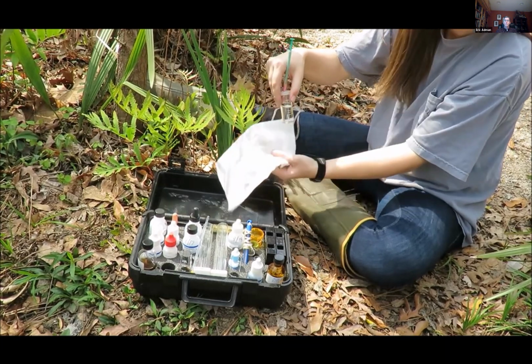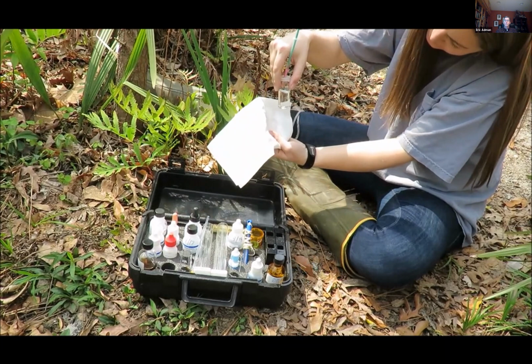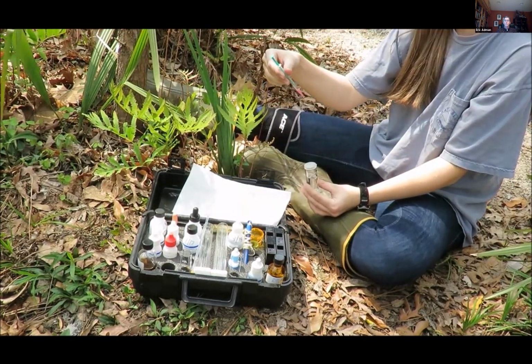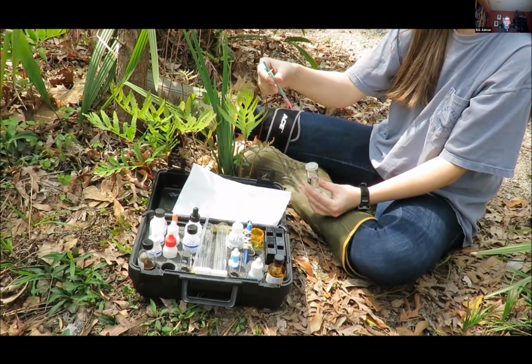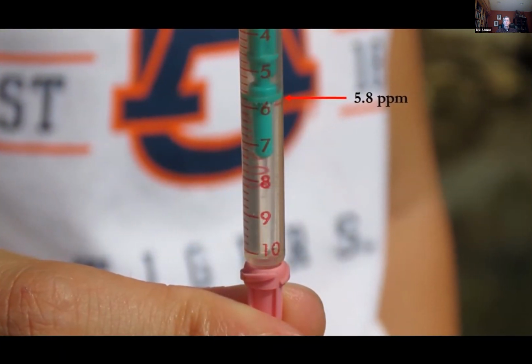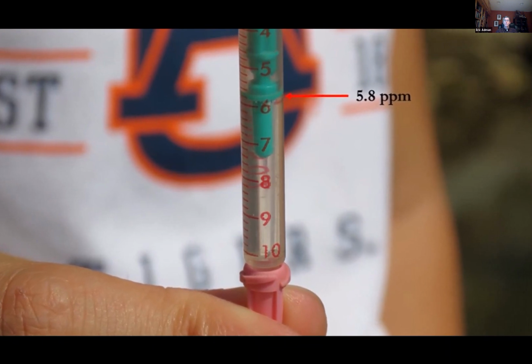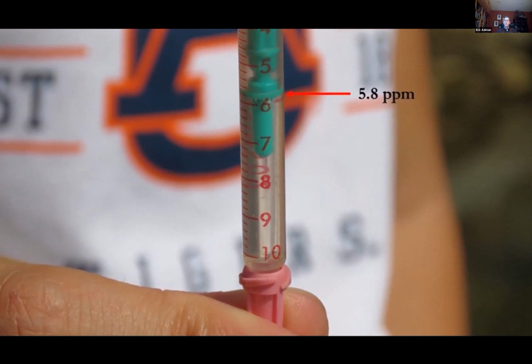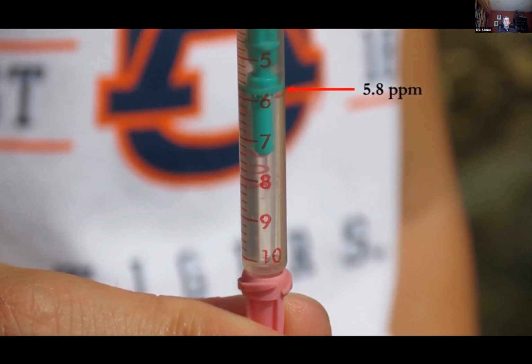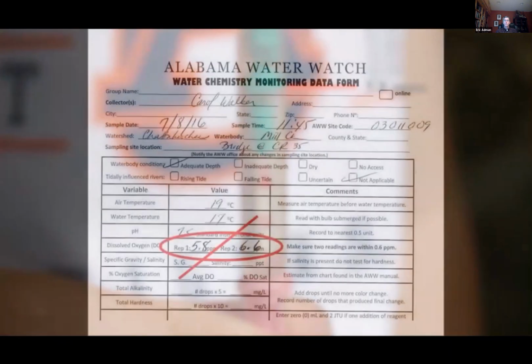Hold the tube against a white background to be sure that the solution is clear and not faint blue. Read the number on the titrator where the widest part of the plunger meets the line on the scale. Each minor division on the titrator scale equals 0.2 parts per million. Record the value to the nearest 0.2 parts per million. Repeat these steps for the second sample bottle.